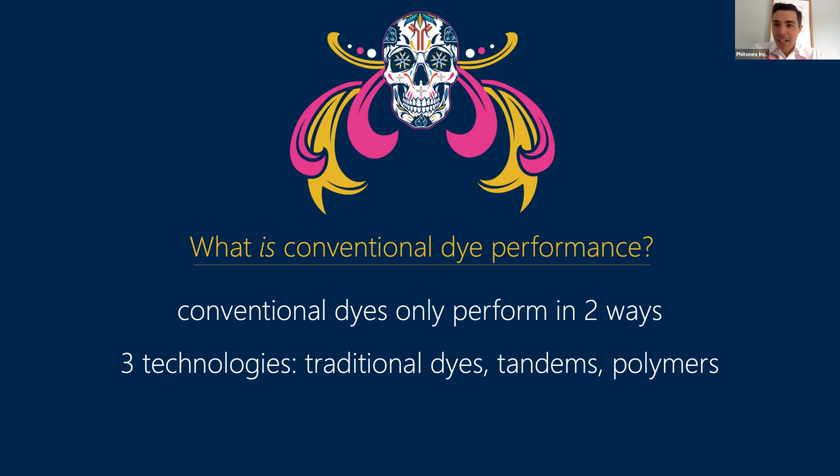The timing is really interesting because we're quite literally analyzing the 45 color experiment that we just ran. So we're right on the cusp of that. I don't have anything to share that's specific to it, but I can tell you that it went well. I'm using this as a transition in, because what we're doing now is looking at how you can iteratively do panel design and take away traditional labels and then replace them, essentially one at a time, with NovaFluors. We're seeing some really interesting stuff.